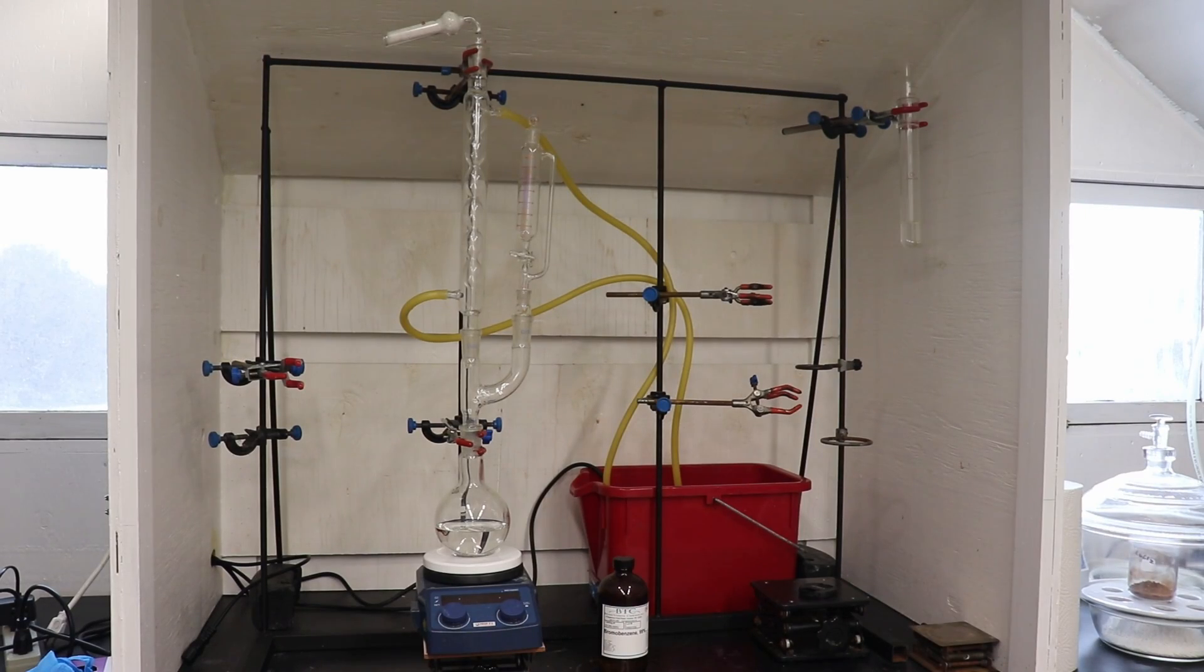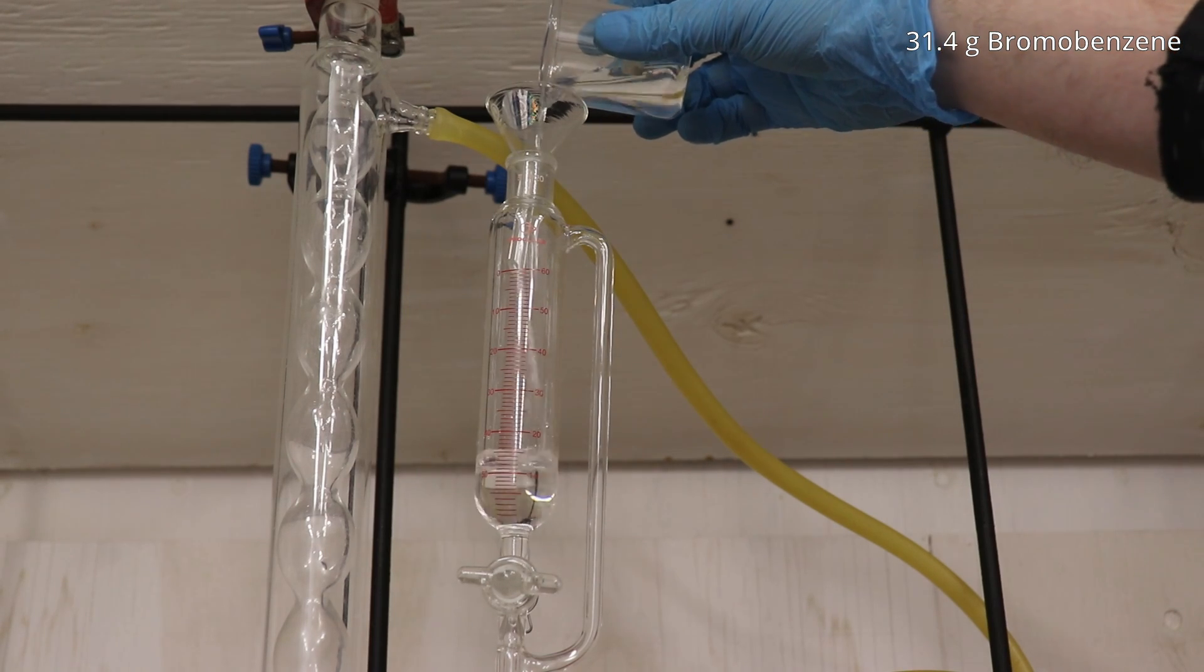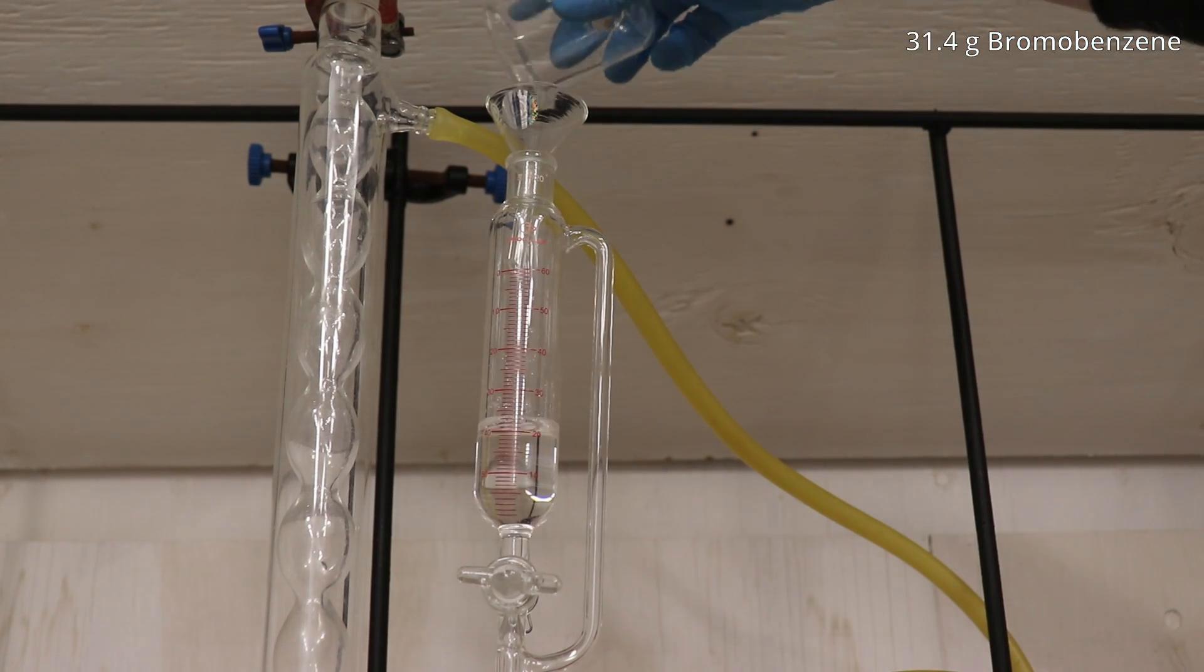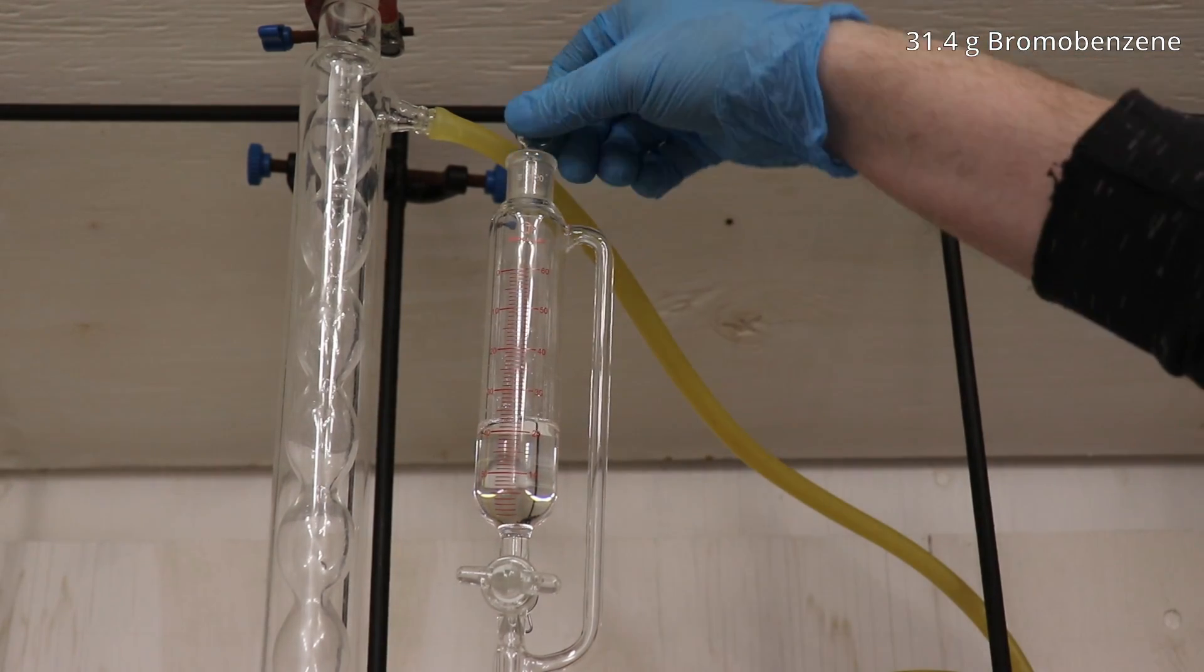And here's the whole setup for the preparation of the Grignard reagent. Note the calcium chloride drying tube which prevents the ingress of atmospheric moisture which would otherwise destroy our phenyl magnesium bromide. The addition funnel was charged with 31.4 grams of bromobenzene, then a few mils of the bromobenzene was allowed to run into the flask to begin the formation of our Grignard reagent.